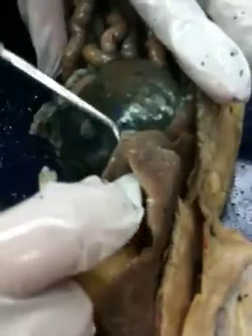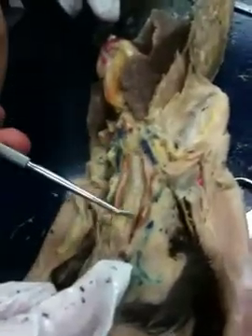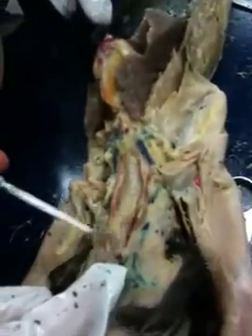Now, on the liver, you see this piece of clear blue stuff right here? This is your falciform ligament. It connects up your liver to your diaphragm. Okay. And that's on the list. Now what else do we need to do up top? The trachea? Yes. This is considered the trachea right here, and this is considered the larynx.